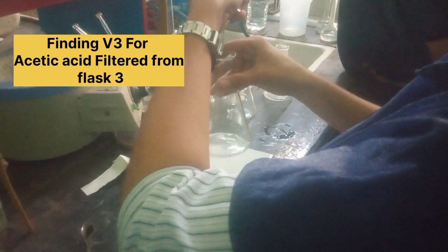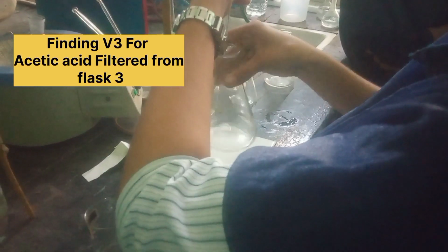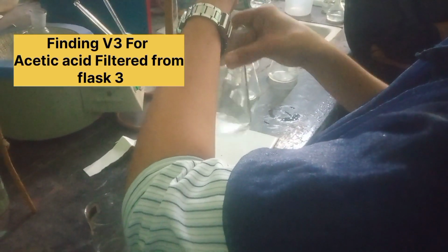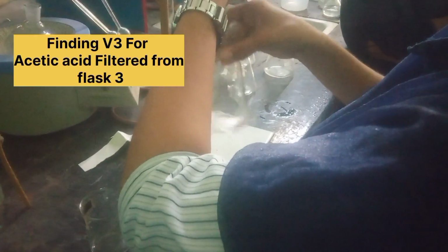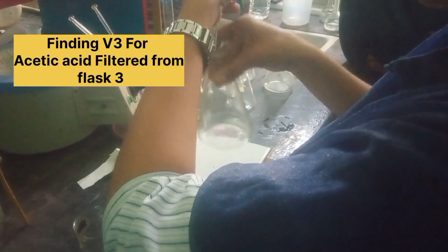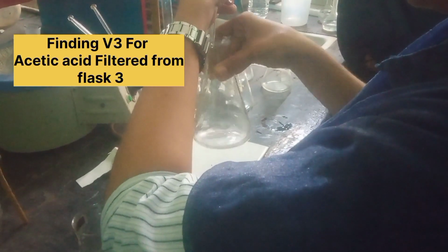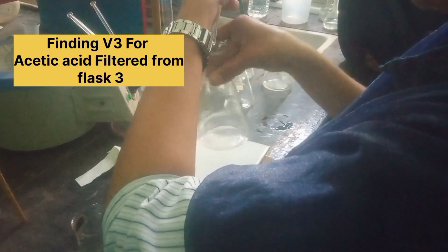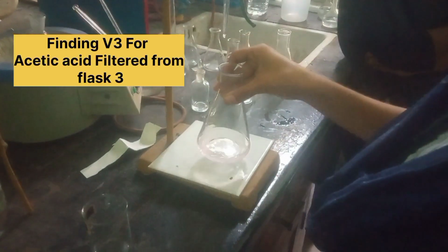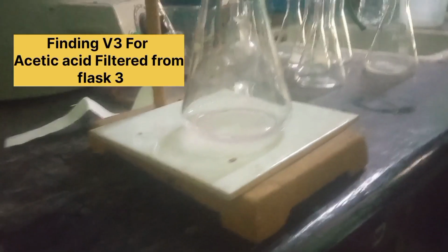From these values, the concentrations are to be considered as concentration of pure acetic acid Ci, initial concentration, and C1, C2, C3, C4 are the concentrations of acetic acid solution filtered from different standard flasks having different mass of charcoal, which is used as adsorbent in this experiment.